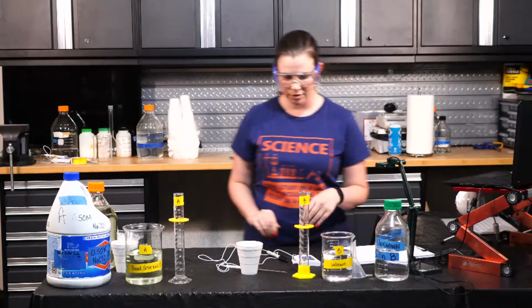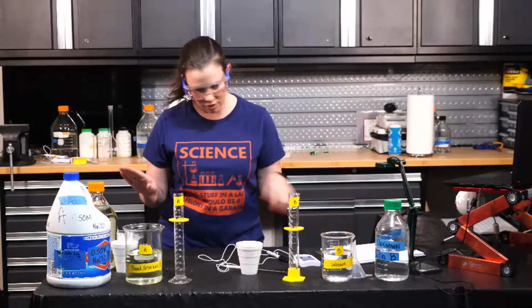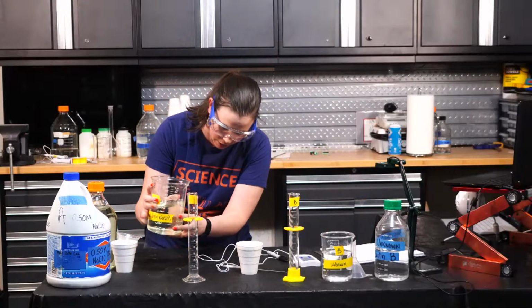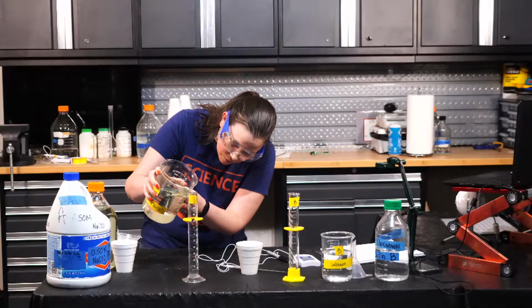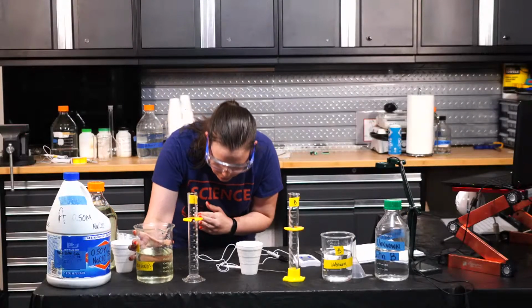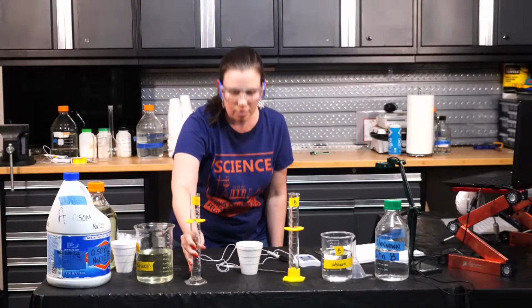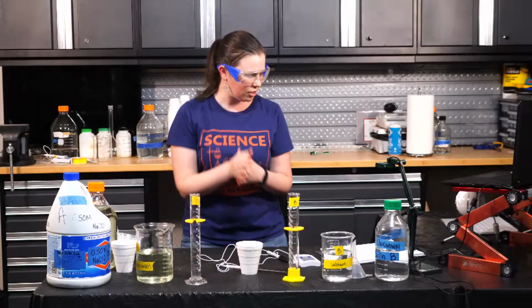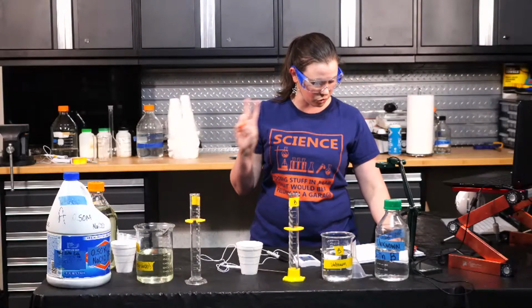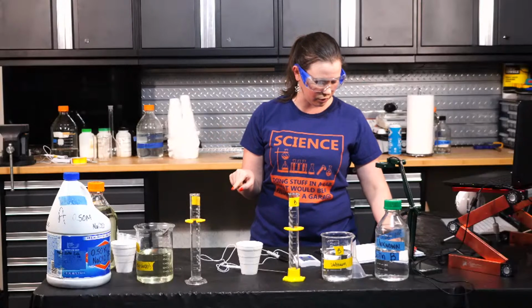Let's start with level 1. We are going to start with, let's see here, this is solution B. So let's start over here with the bleach. 5 milliliters of solution A. Oh, you know what I just realized? I can't measure 5 milliliters in a 100 milliliter graduated cylinder. So timeout, or actually, let me skip to level 2. And I need to grab a different graduated cylinder for level 1.